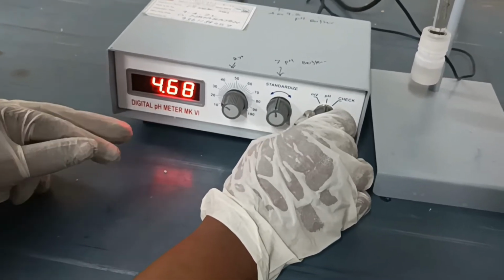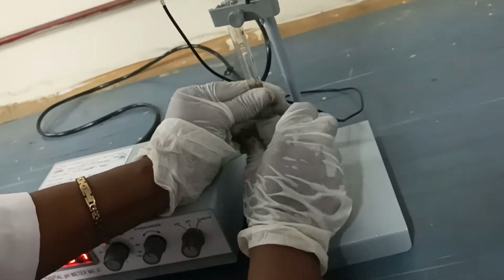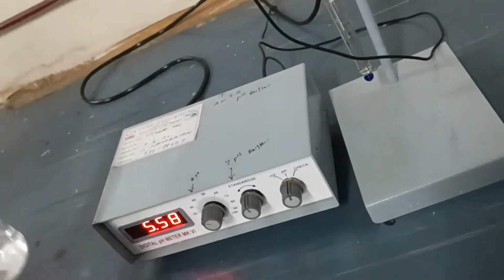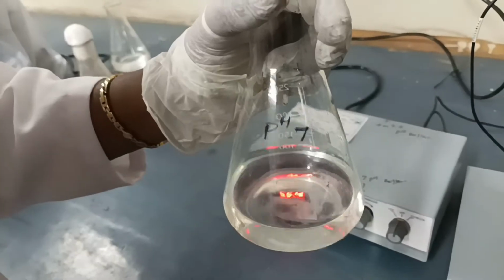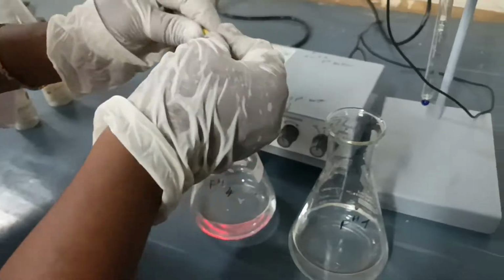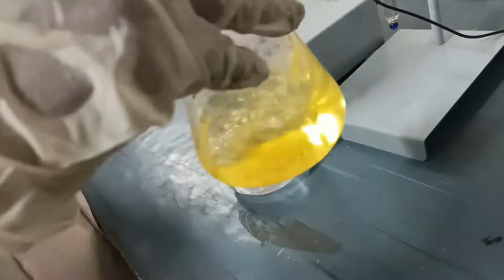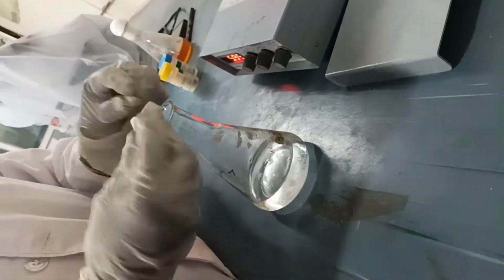So, first calibrating the pH meter. For calibration purpose, we are taking two color-coded standard buffer solutions of pH 4 and 7. Take 100 ml of distilled water, add 1 buffer tablet of pH 4 and mix well. Now the pH 4 buffer solution is ready for calibration. Next flask, add pH 7 buffer tablet. Mix properly. Now the pH 7 buffer solution is ready.